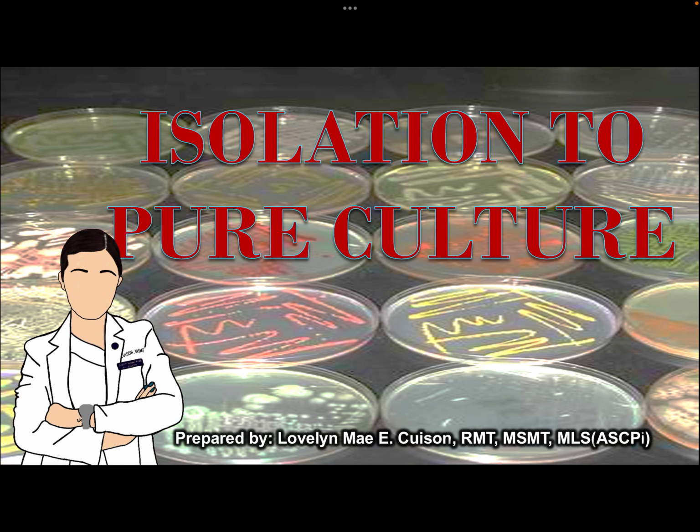I will be discussing the techniques in isolating pure culture in a way that we will be identifying correctly the species of the bacteria in the laboratory. And mind you, the techniques that I am going to tackle here are all manual techniques. So sometimes some of the methods here are already obsolete and they are no longer used in the laboratory.